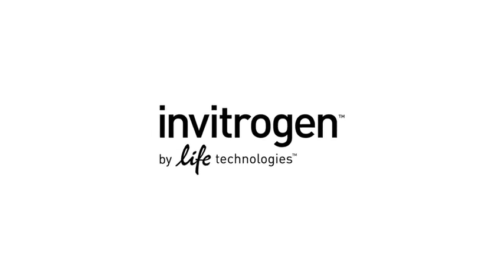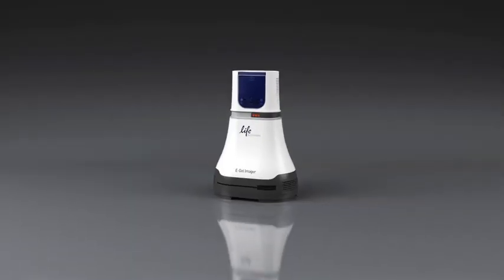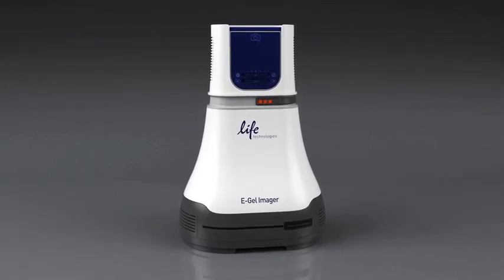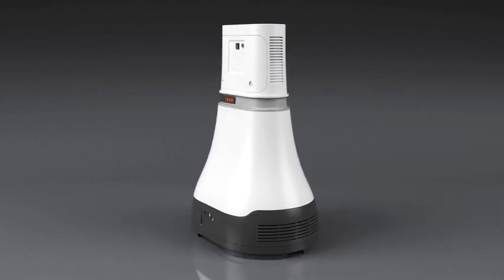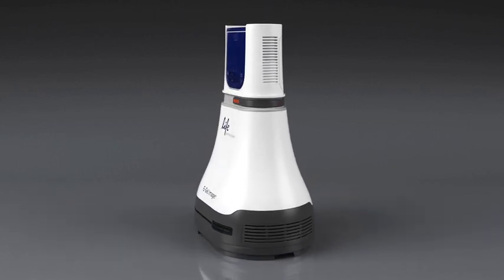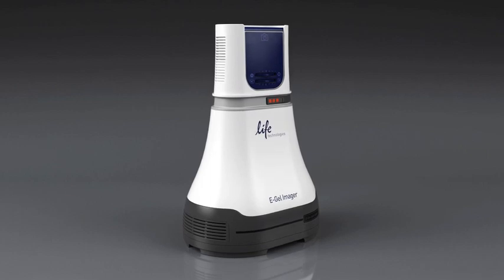Life Technologies is revolutionizing precast agarose gel electrophoresis again. This time we're making agarose gel documentation and analysis personal with the eGel Imager system. The eGel Imager system combines the power of a large complex gel imaging system with the sleek footprint and affordability of a benchtop device. Not only is the eGel Imager the perfect solution for documenting any Invitrogen eGel precast agarose gel, it's great for self-cast gels as well.